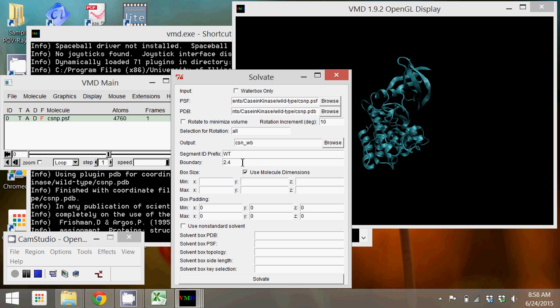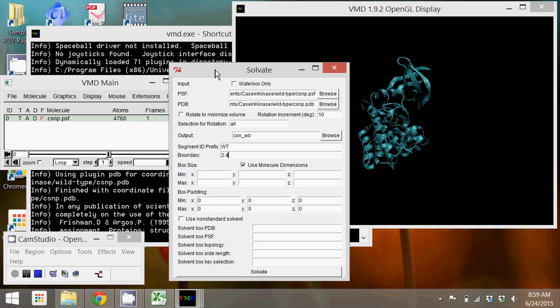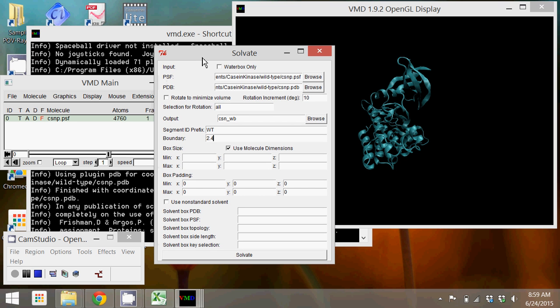If you check the box use molecular dimensions, VMD will measure the size of the enzyme and solvate it accordingly, and that makes the rest of the parameters below not so important. You can just skip all of them, click solvate.